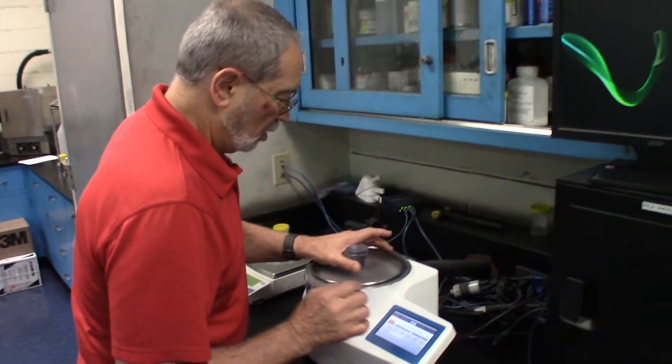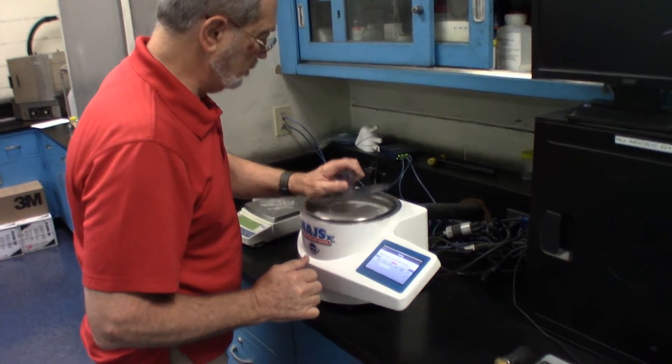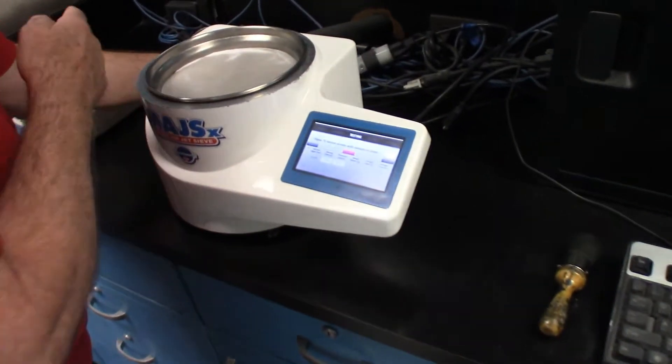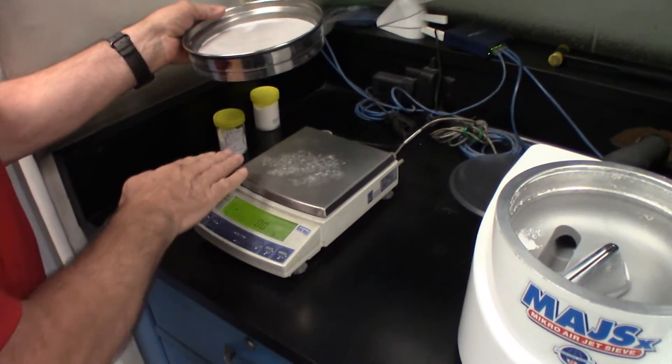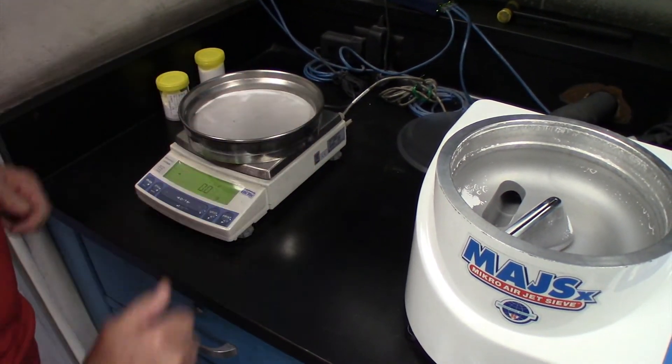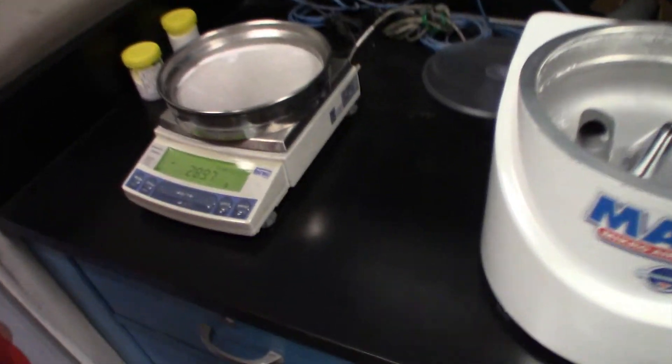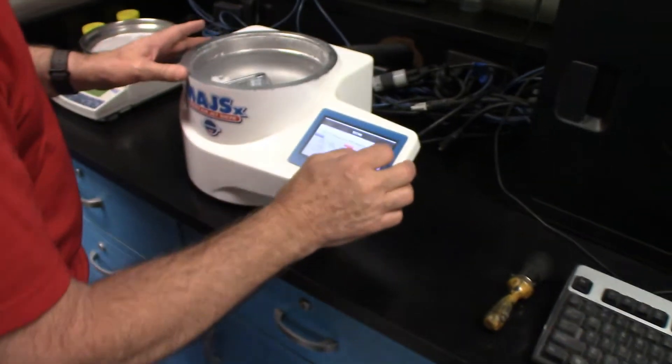Now that the air and the distribution of the material has stopped, we're going to press the next button, which activates the balance. We will take the sieve screen out, place it on the tared balance. Notice there's a slight powder on here. That doesn't matter because the balance has been tared. We're now going to take the weight and accept that weight.